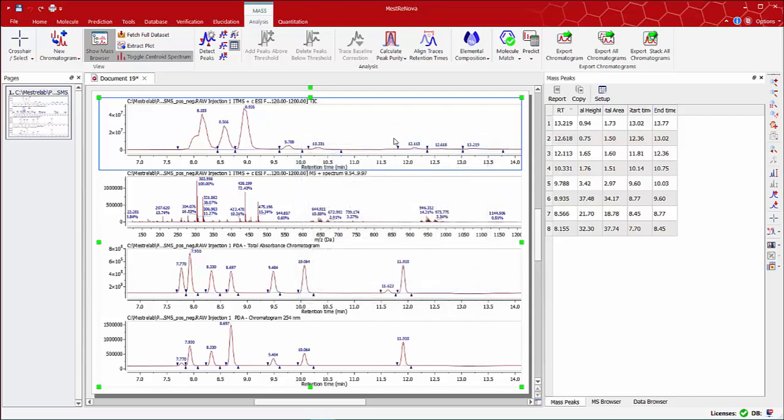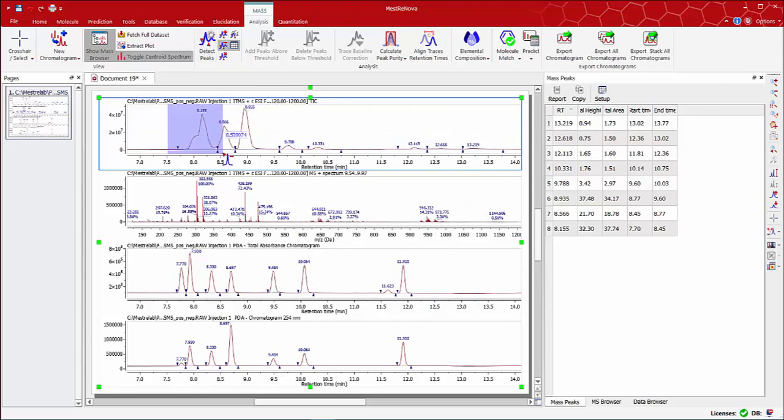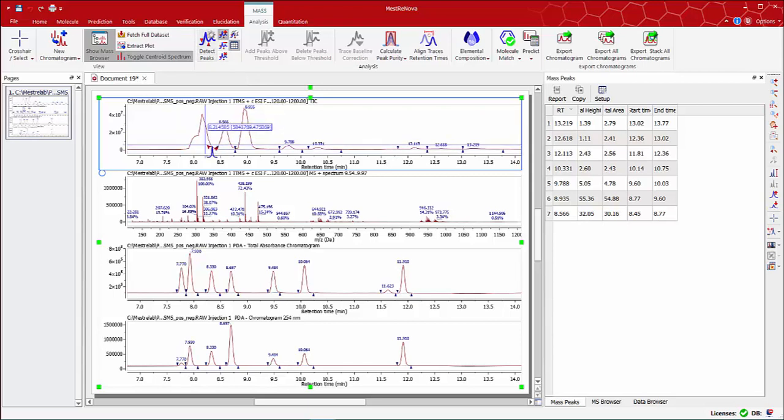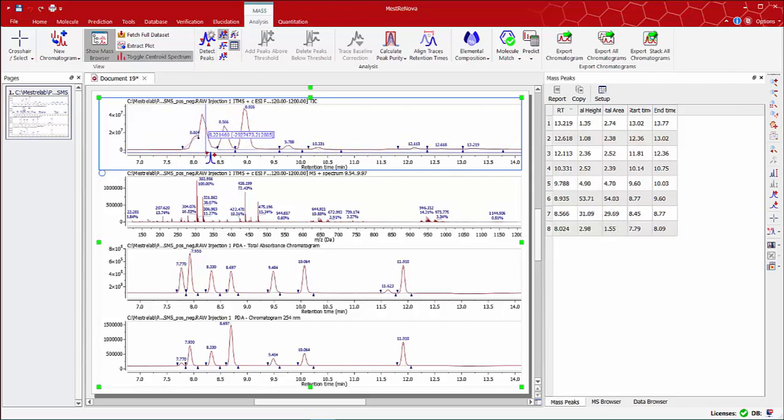Alternatively, you can manually change your peak integrals. For example, you can delete any peak detection and also add some more peaks. You can also change the integration manually.